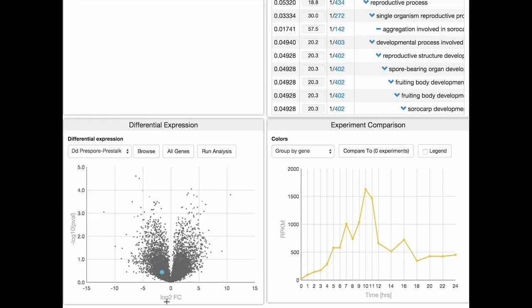In our example, genes to the right have higher expression in the pre-stalk cells and genes to the left have higher expression in the pre-spore cells. The Y-axis measures statistical significance.